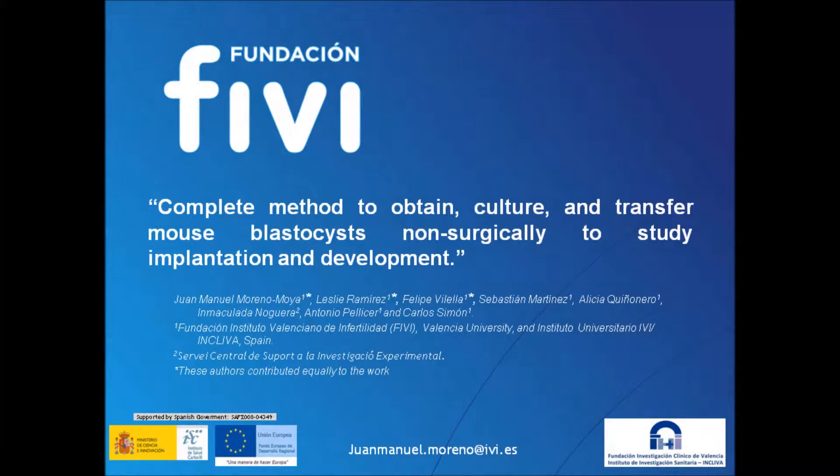In this work, we are going to explain a complete method to obtain, culture, and transfer mouse blastocysts non-surgically in order to study implantation and development.